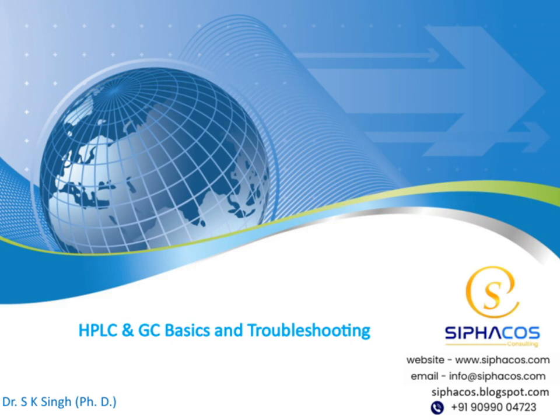Today, we will be exploring the basics of HPLC and GC, along with troubleshooting tips. This presentation is designed to give you a clear understanding of these essential techniques. We will cover fundamental concepts, common issues, and practical solutions to help you improve your analytical skills. I look forward to sharing this knowledge with you.